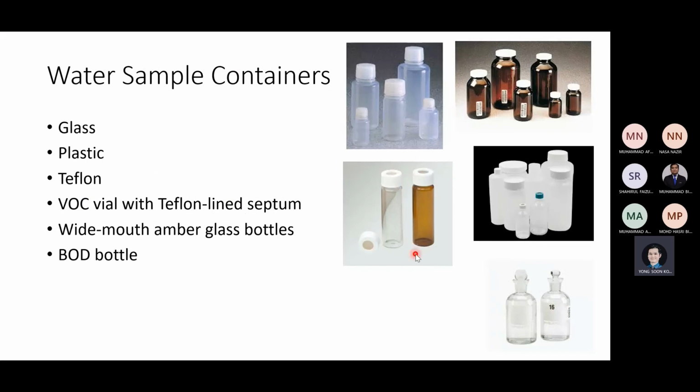When they are put inside here, this vial is put directly in maybe an HPLC or GC-MS, where the machine will have an autosampler with a needle. It directly pokes inside here and then they analyze straight away. And why is this so? Because the moment you open it, it will start releasing the organic content. So usually we don't open it at all.